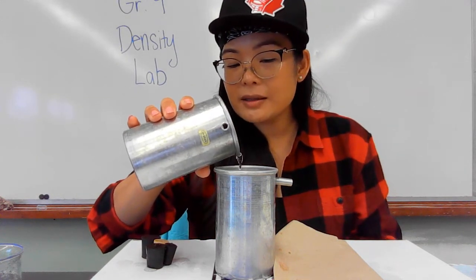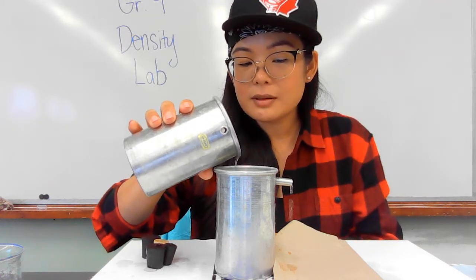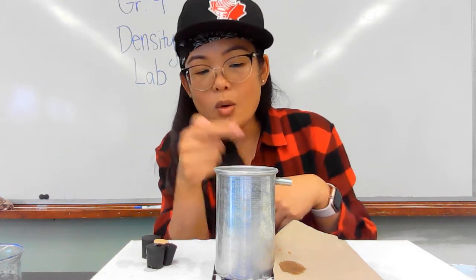Ever so slightly until I start seeing some overflow coming out. There. All right, did you guys see that drop? So that means the water level is exactly where that little hole is.